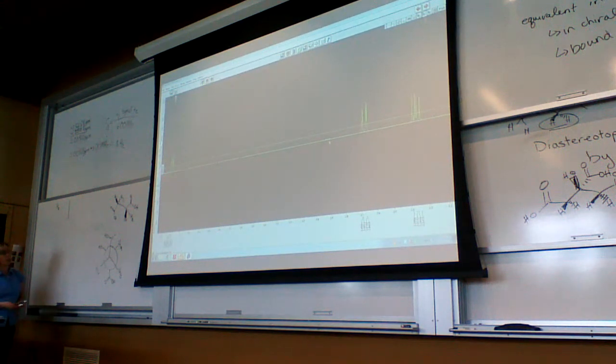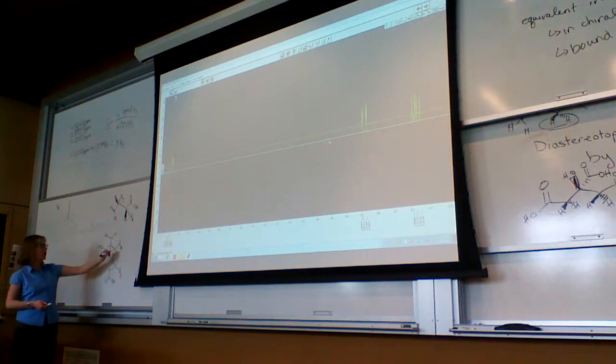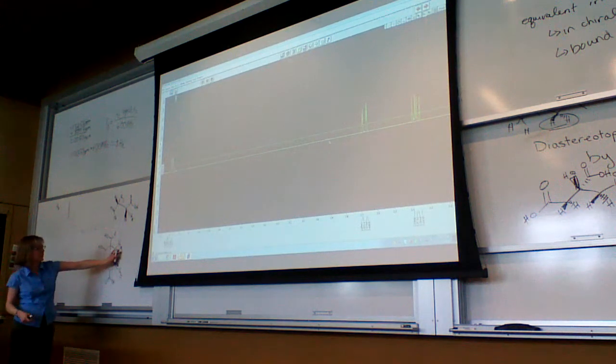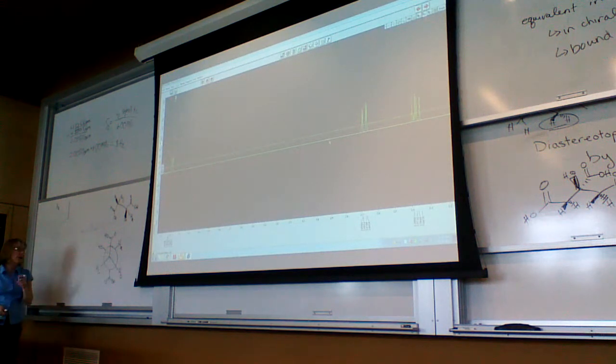When we do that and we draw out the Newman projection, you see that A and C have a 180-degree relationship. So going back to Friday when we talked about the Karplus relationship, 180 being on the high end of the J coupling, and then 60 being on the low end. So the 2 that are right next to each other are on the low end. That's as far as I could find. I didn't find definitive evidence on that, but I'm pretty confident in that.